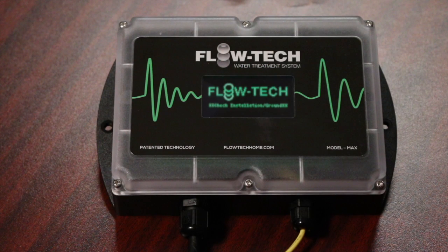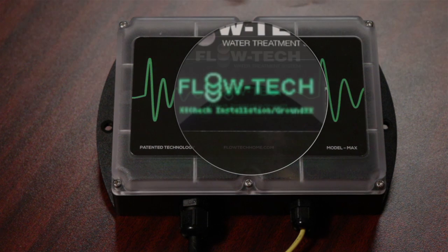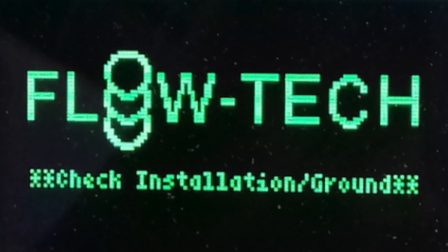Operation screen when low current is detected. If the current is below 0.2 amps peak to peak, the diagnostic reading tends to be unsteady because the noise level of the reading becomes significant. If this occurs, it will follow with a message to check installation/ground, which you can see on the bottom.